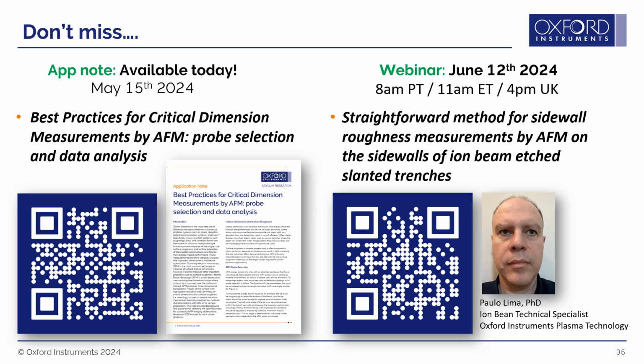But in the case of tapping mode imaging, as is the case in these results shown here, we focus more on the tip shape and tip height than on the spring constant. It happens that the spring constant here is in the 20 newtons per meter range. But again, it's more to focus on the other properties of the probe than the spring constant in this case.